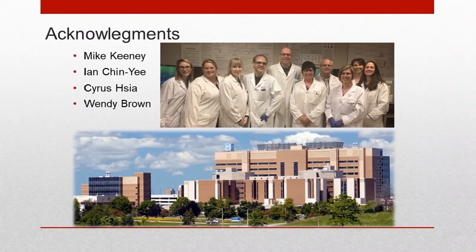Great, thank you. Can the ClearLab control cells be used on other flow cytometers? They've only been validated on a Navios and a Navios EX, right? That's the standard answer. There's no reason why they probably couldn't. They're process controls, so they work as samples do. They are stained and washed.